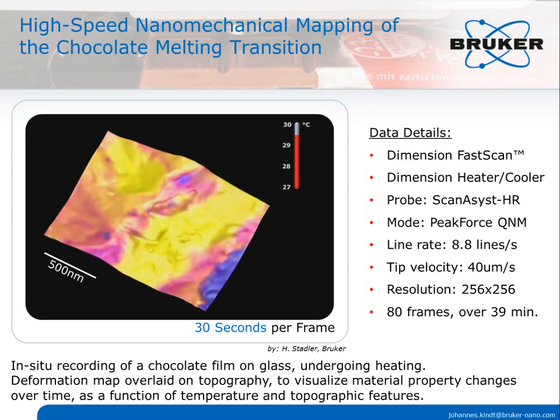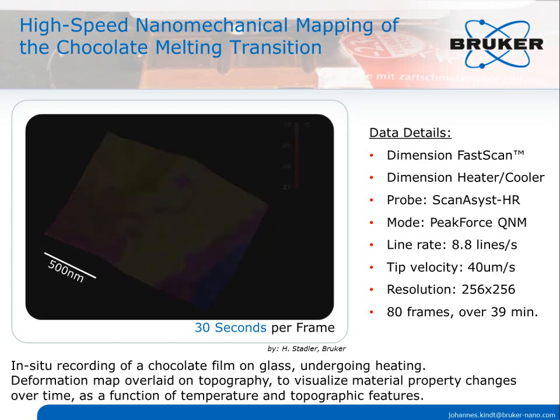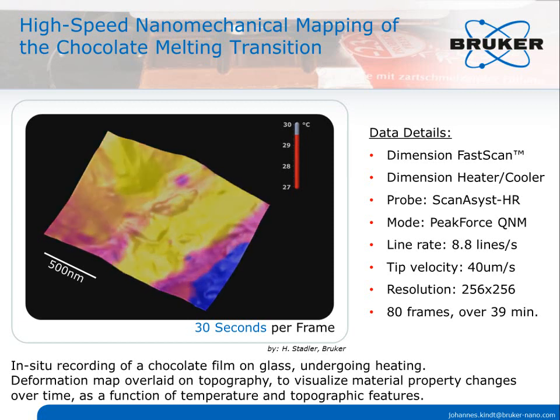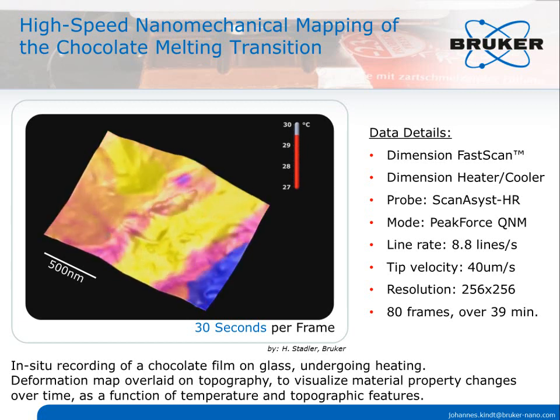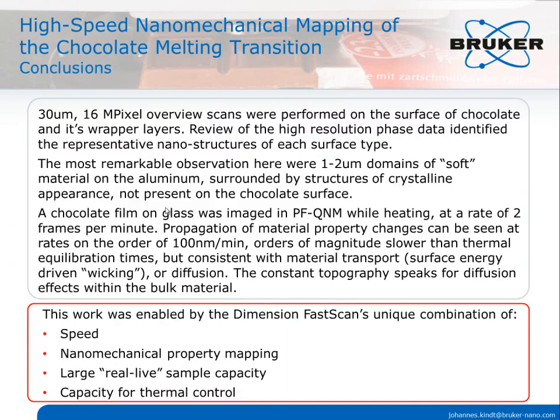The surface topography is fairly stable throughout the movie. Therefore, inner material transport effects, for example increased solubility or miscibility, could be the cause. The fat phase separation seen in the literature after thermal cycling is more likely to occur during a cooling cycle. The technique of combining high-resolution, high-speed topography data with simultaneous, slightly lower resolution QNM data could be interesting for the study of many dynamic processes.